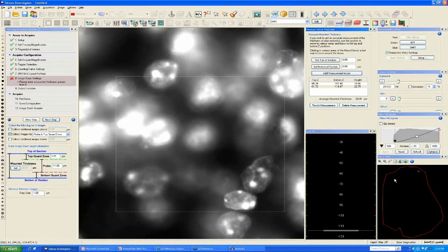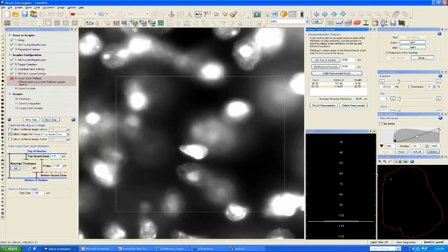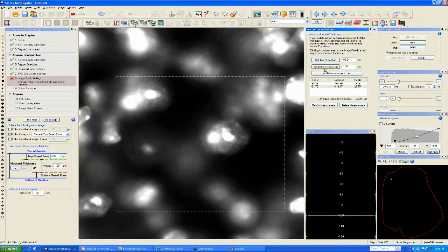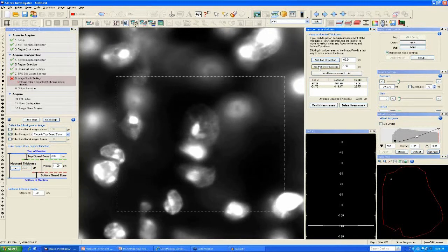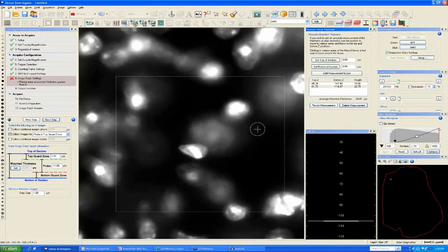The number of locations that you choose to measure thickness will vary depending on the size and area of your contour. The larger your contour is, the more locations you are going to want. If you believe that you generated a measurement in error and are confident that it does not truly reflect the tissue thickness at that region, you can select it here and delete it. Then you can repeat the measurement or move on to another location to measure there.